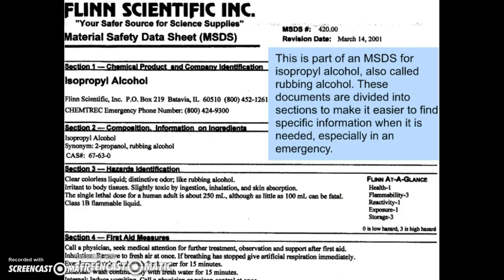This is only part of the MSDS. You can see, though, just by looking at this part of it, that this document is divided into a bunch of sections. You can see 4 of those sections here. Really, there's going to be more like 15 sections by the time you're all the way done with this, because, again, it covers lots and lots of information. We will talk more about the MSDS for acetone on Thursday.